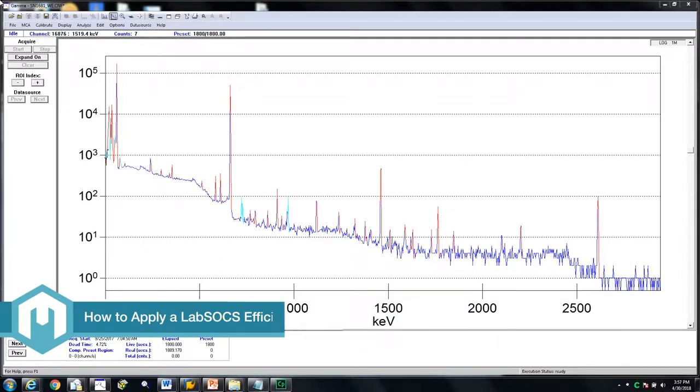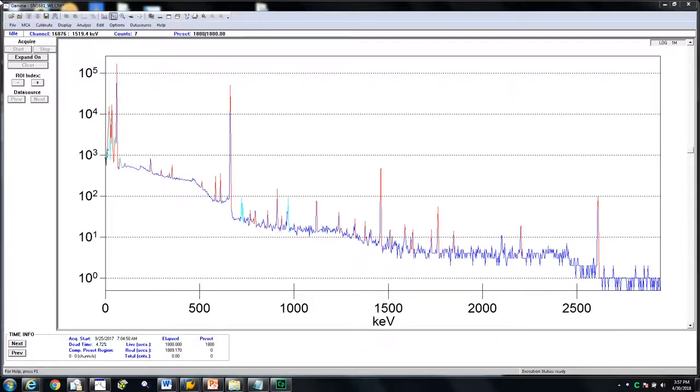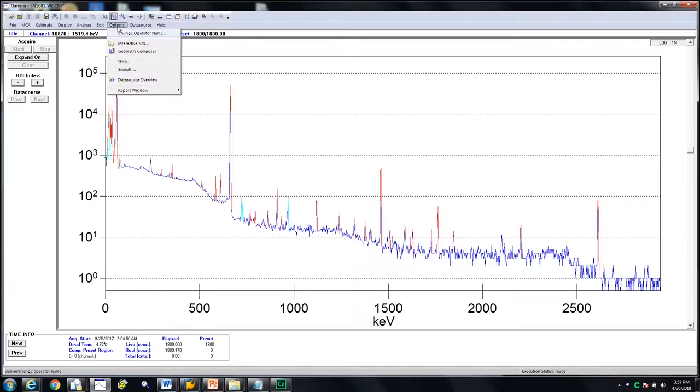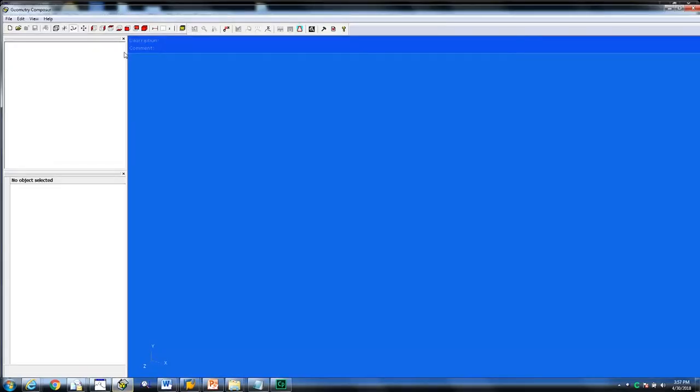The spectrum shown here is an americium and cesium spectrum measured in the well of the Sage Well Detector. The first step in applying a LabSox efficiency calibration is to open Geometry Composer. Click on Options, then click on Geometry Composer.